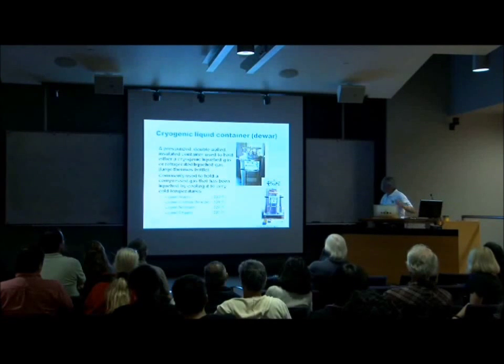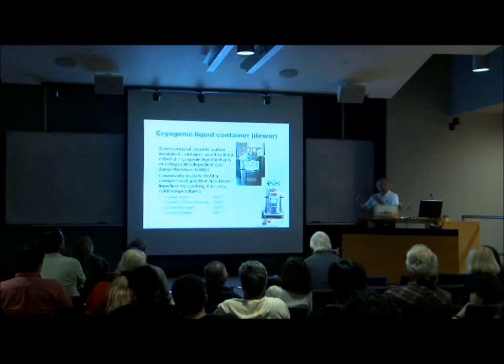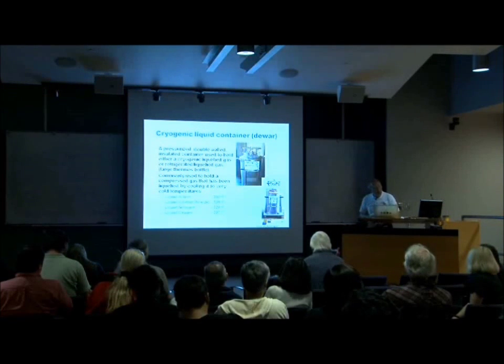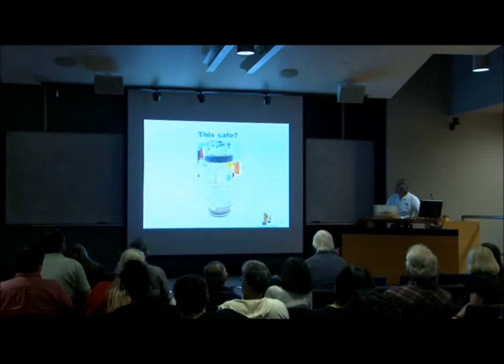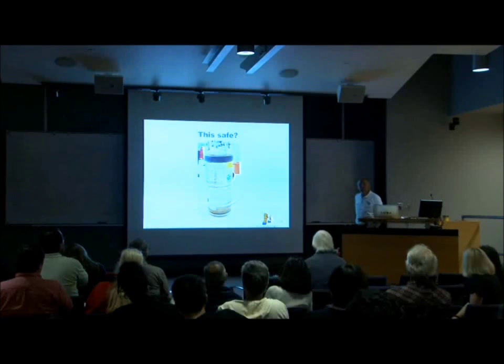And then cryogenic dewars. We talked earlier about cryogenic liquids that are in these dewars. It's essentially a thermos bottle that keeps the cryogenic liquid cold, but a certain amount has to vaporize in order to keep it cold. So, you have a dewar, and this happens. Is this safe? What's going on here?